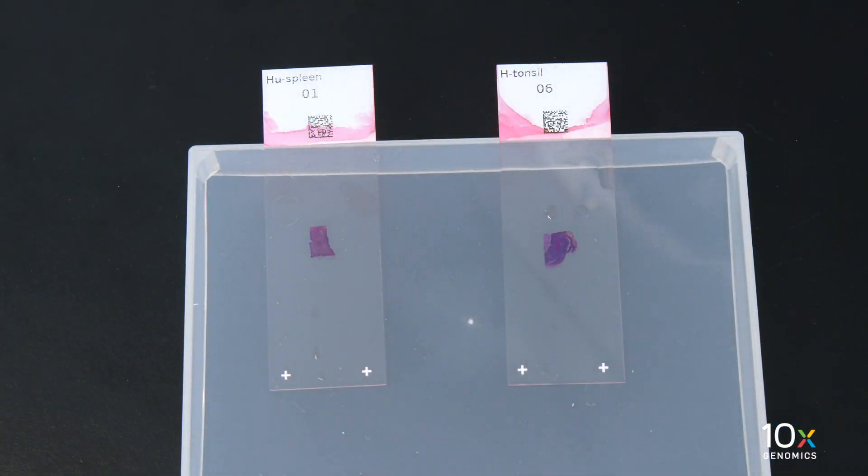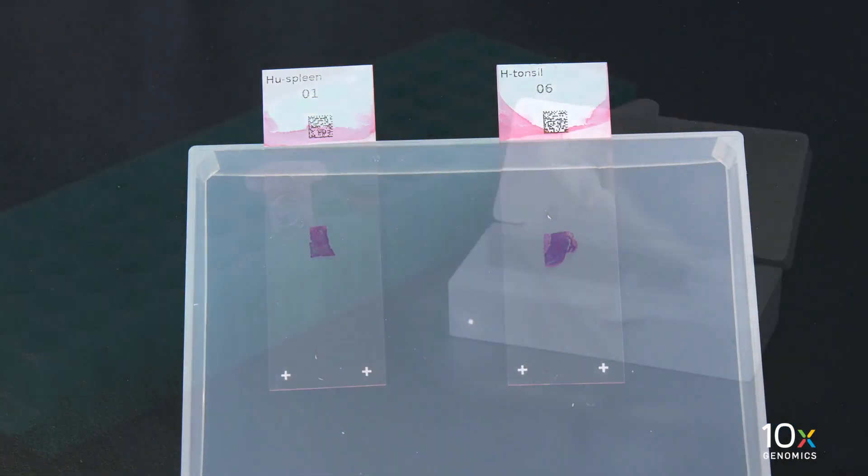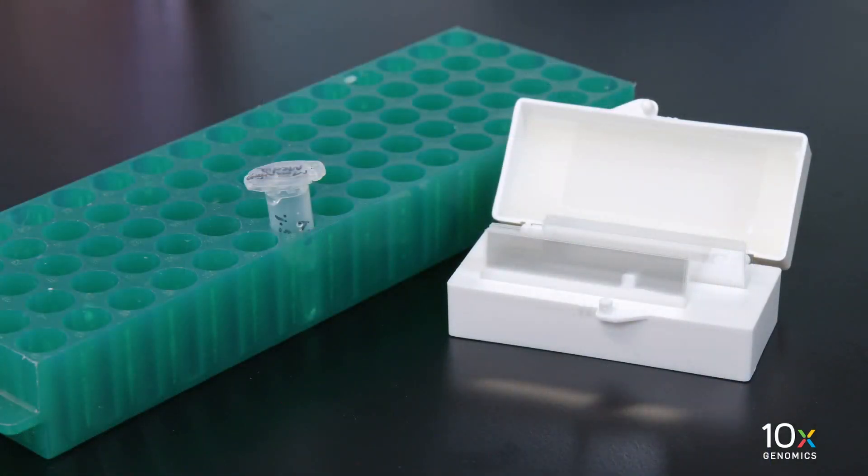We have completed tissue staining. Now we will mount a cover slip on the tissue slide. We have the deparaffinized H&E stained slides and previously prepared mounting medium and cover slips.